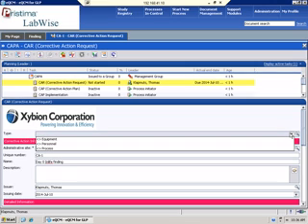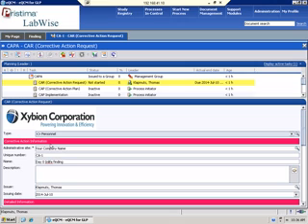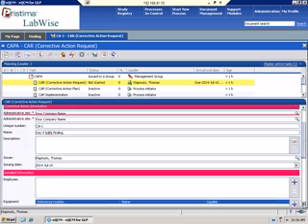And so here we have several fields. Again, the CAPA process is configurable to your business flow. And so this is just a generic out-of-the-box process that we have defined. And so here you define, was it a process, was it personnel, or was it equipment? And so in this case, it was personnel. Again, it pulls CAPA, it pulls the finding name, it pulls the issuer and the issuing date. And again, if I had a description defined, it would pull that as well. So it pulls that information automatically in.